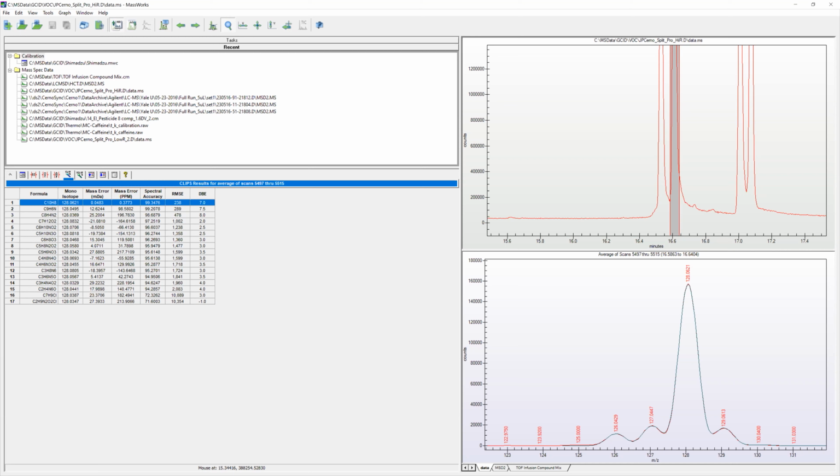Now, if the isomers have different EI fragmentation patterns, or even different unique fragmentation ions, you can spot them by examining the EI fragments and identify the presence of possible isomers and impurities. I hope that answers the question to some degree.